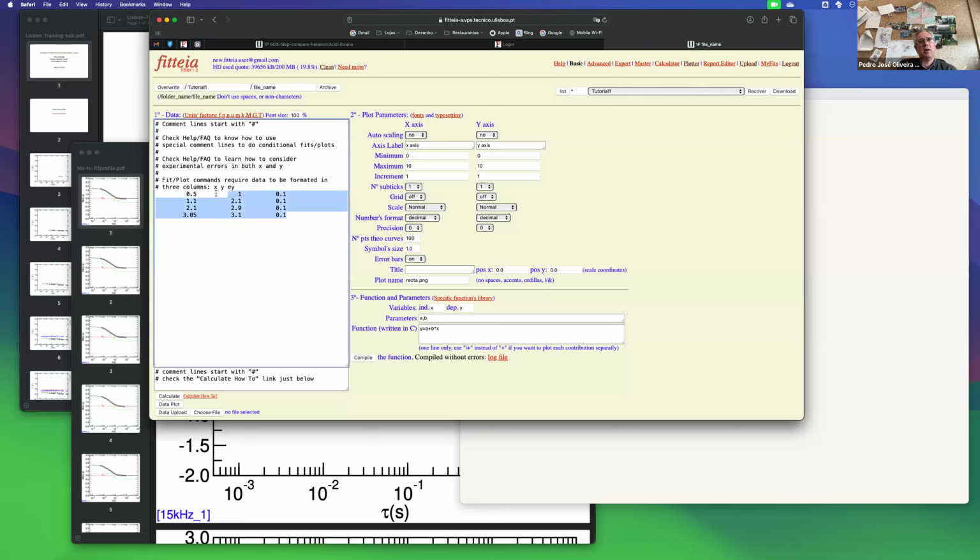You have to put your data somewhere. Here is a text box where I can type numbers. Okay, 1, 2, 3. And you have to choose how your data is represented. So you have to define your plot parameters, like the axis, the labels, the minimum and maximum values, all these things.